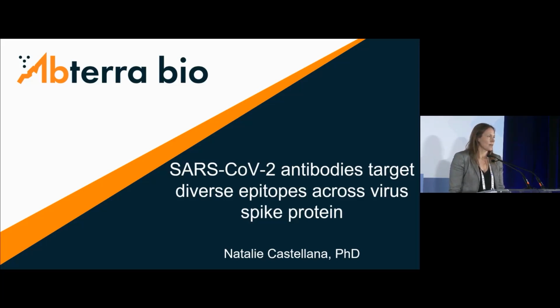We've developed a platform called Alicanto, and that's what I'm going to talk about using in this case to mine convalescent patients for neutralizing antibodies to SARS-CoV2. And I'm also going to take the liberty of assuming that you've heard of that virus and you know that we're in a pandemic, and I can kind of skip over the basics.